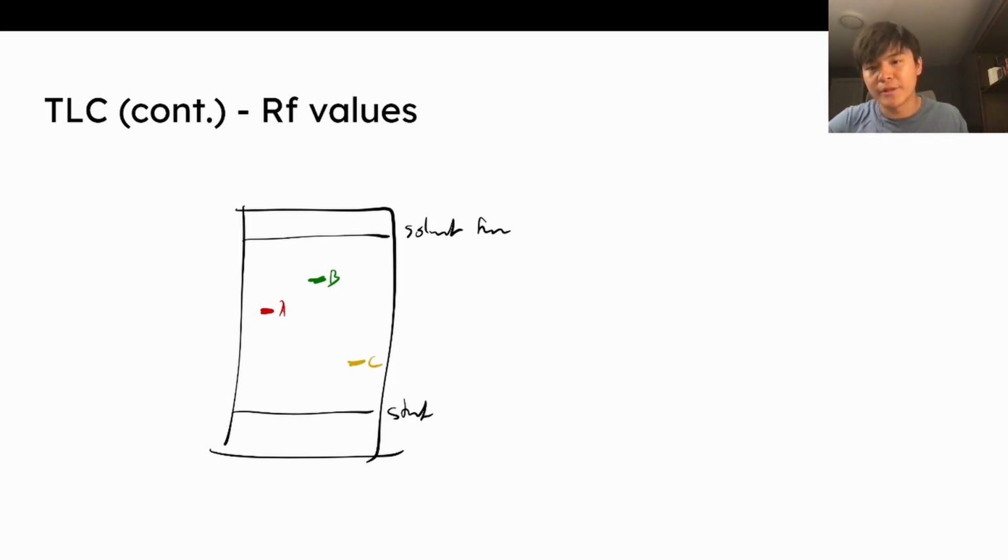How do we know what these proteins are? And obviously they're quite hard, but let's say you know what 3 proteins are in this mixture, right? And then now you need to assign them. What we have come up with is something that's very, very genius. We have come up with something called RF values. And basically what this is, RF is a unique number attributed to each protein and is calculated by this.